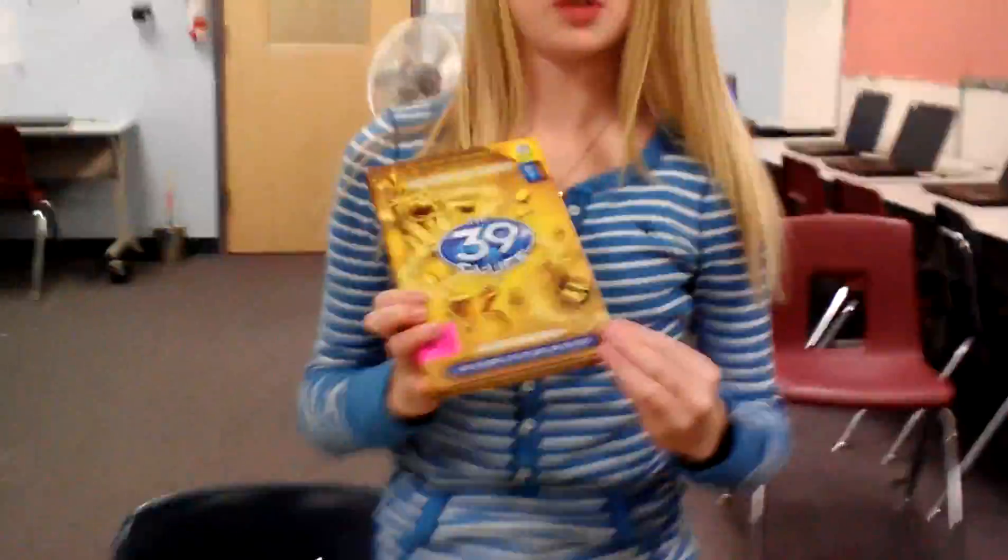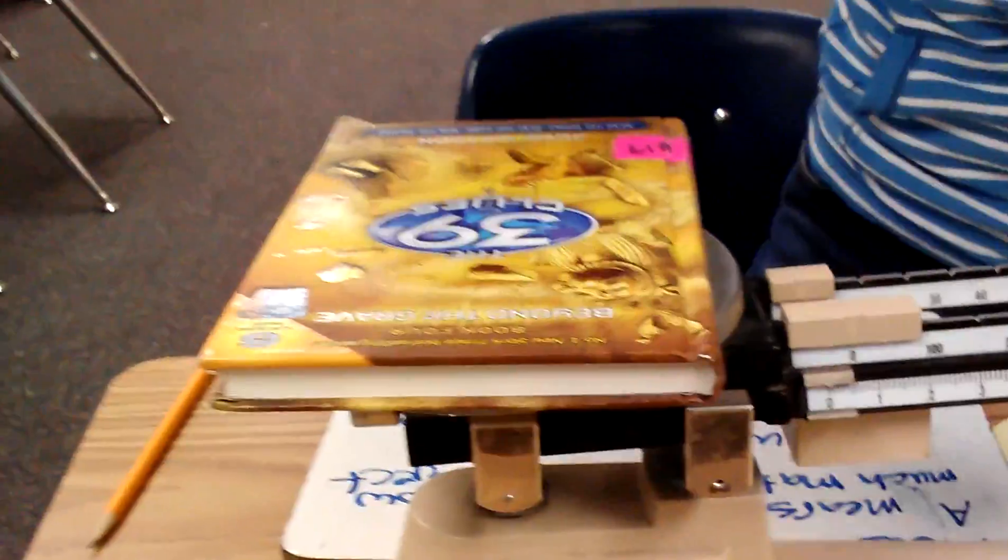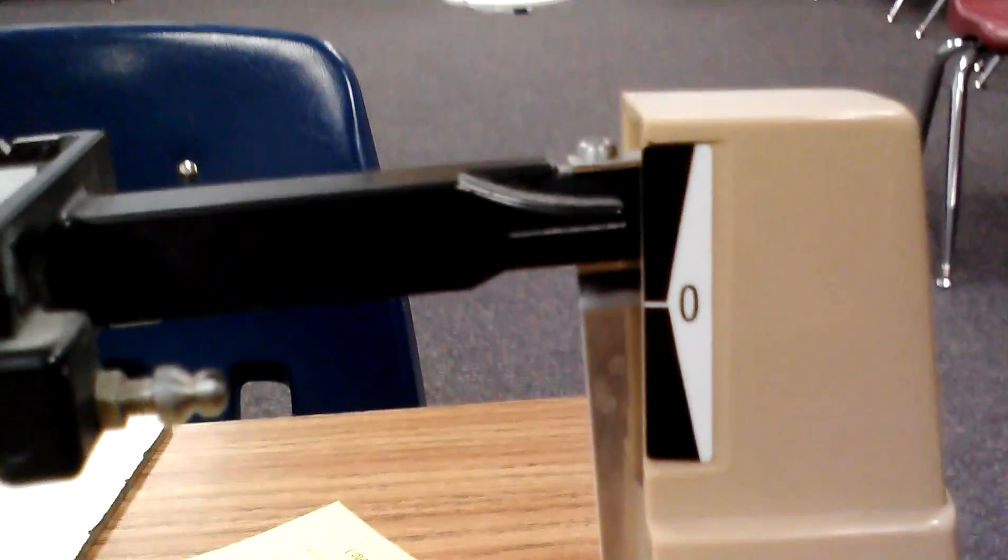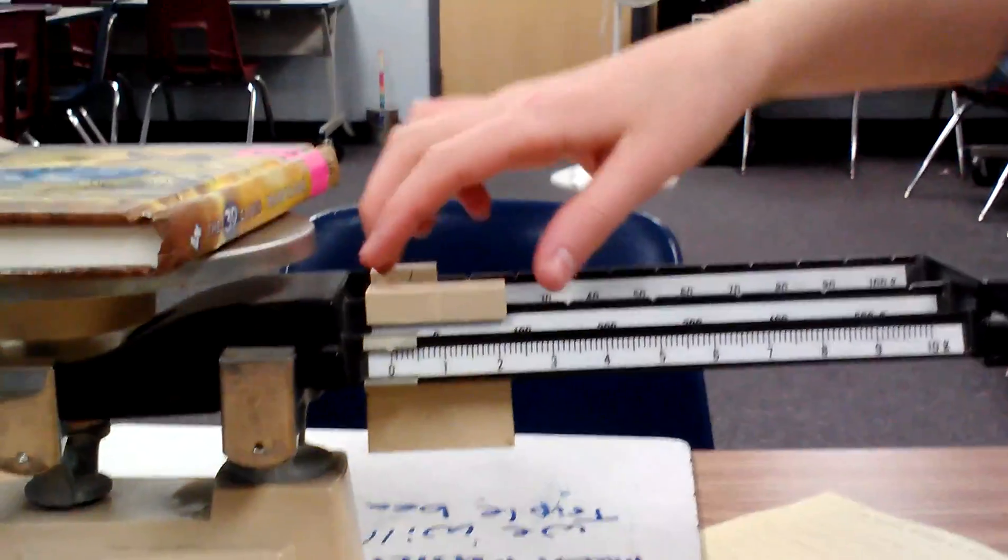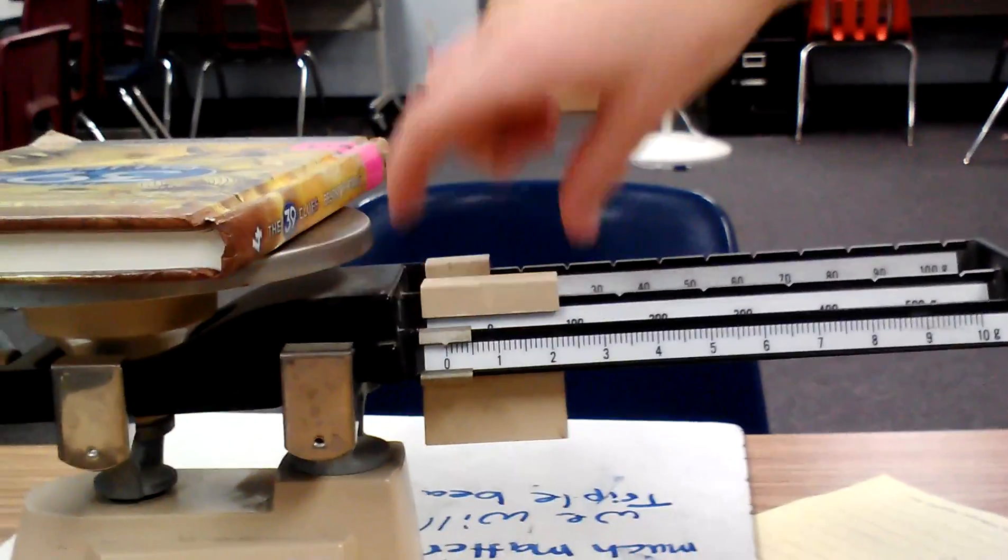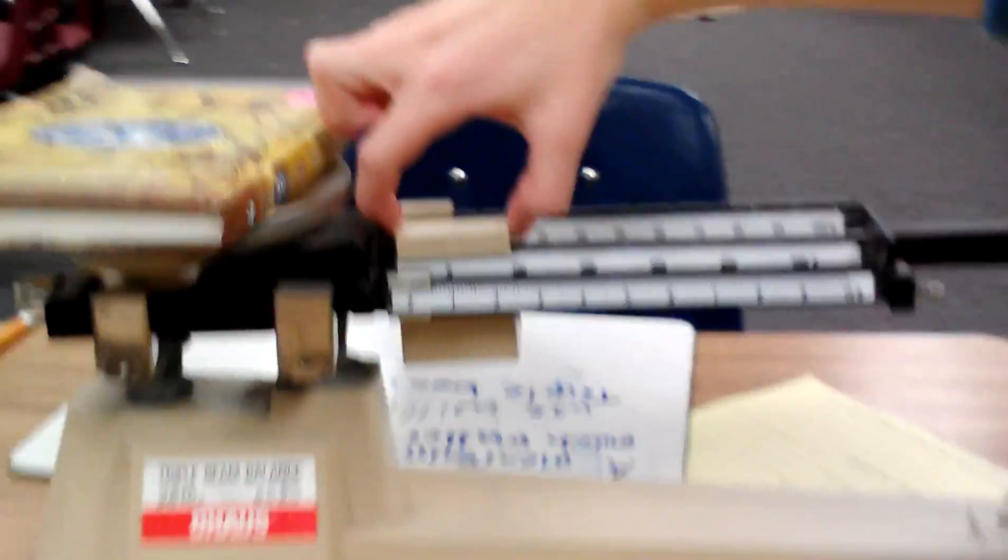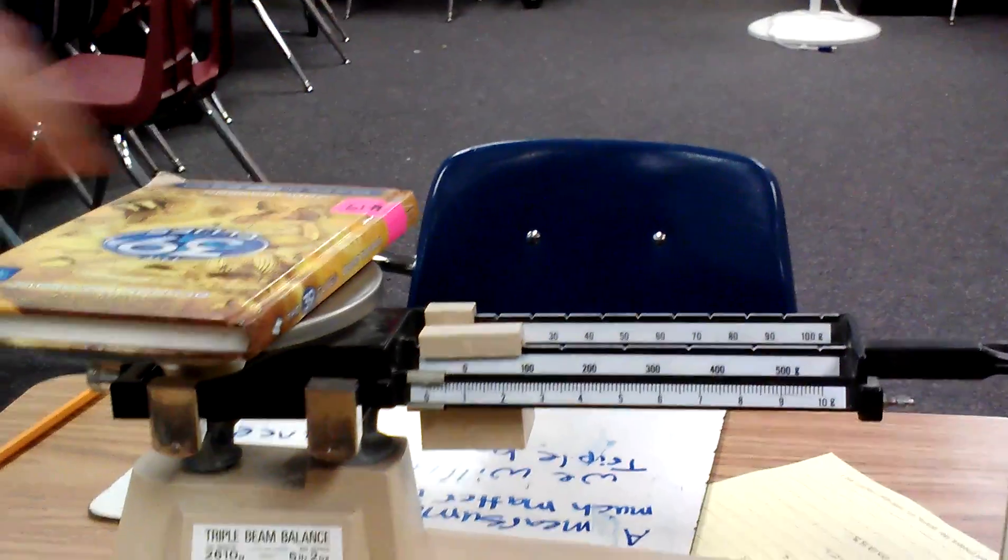Okay, so now you're going to take any object and you're going to measure the mass of it. So you're going to take this book and set it on the scale. And so, see, it just went up. So now what you need to do is you need to start with the hundreds. And you always start with the hundreds and go down. Austin's going to show you how to do it.